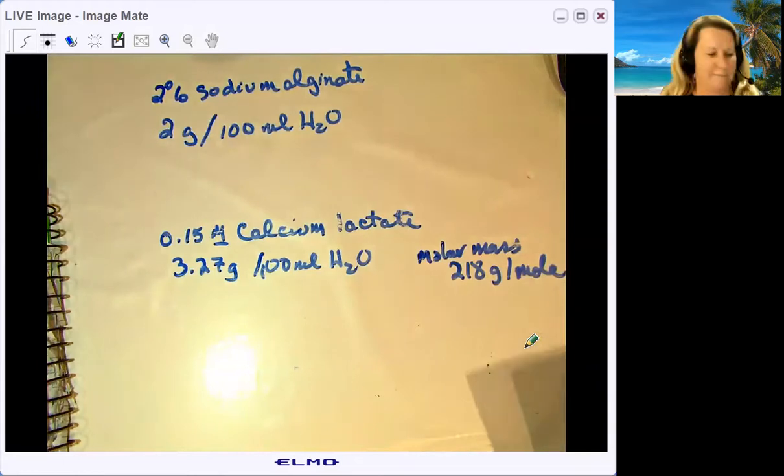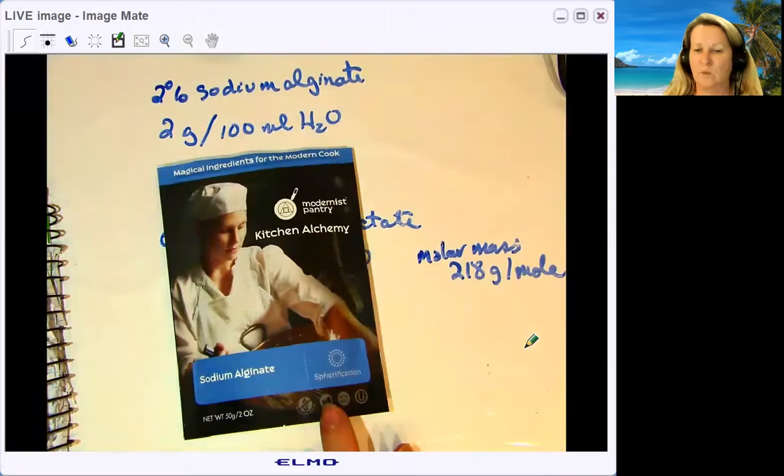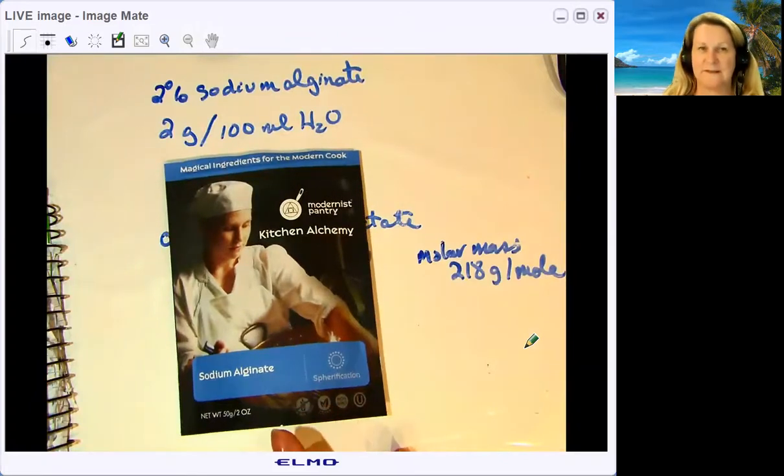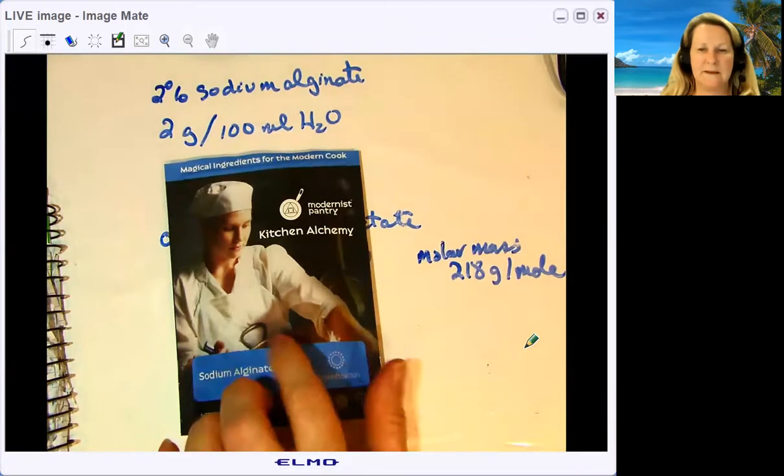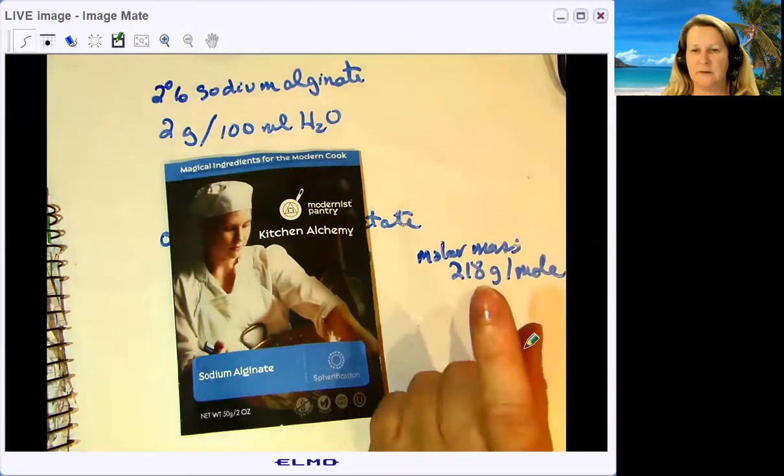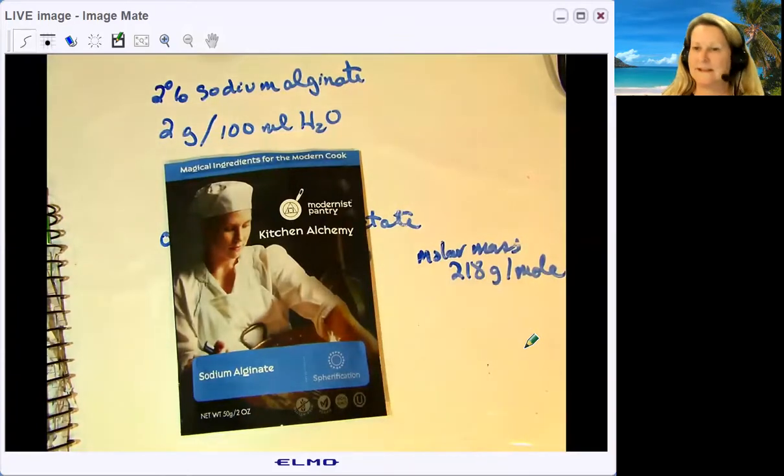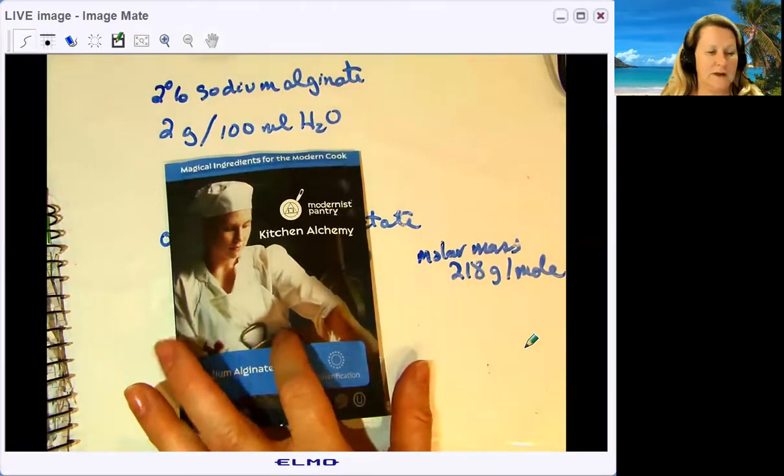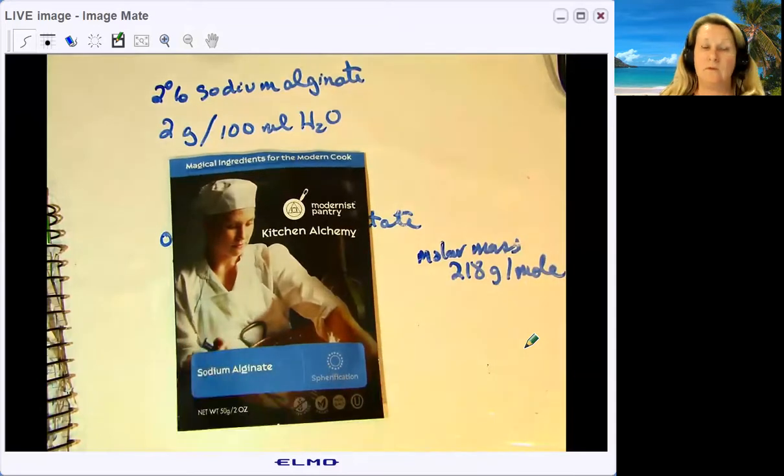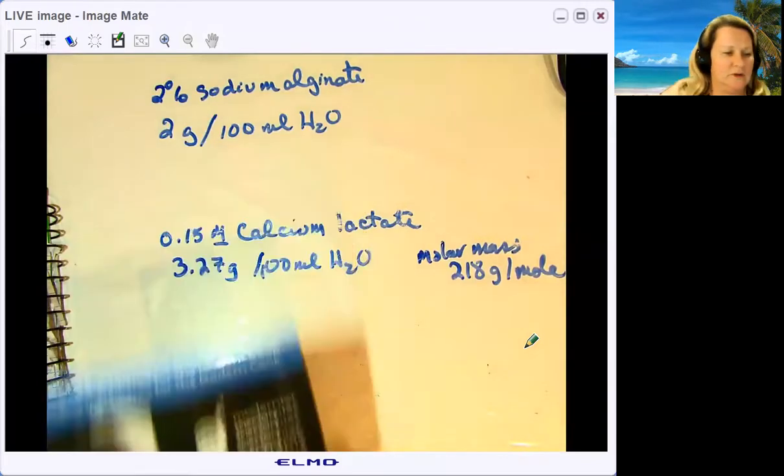Let's talk about the sodium alginate first. When you put sodium alginate in water, it's a really viscous solution. You don't want to make up a whole liter and try to pour it out for every lab group—that won't work well. When I make this up, I get a bunch of 150 or 200 mL beakers and make up 100 mL for each lab station. 100 mL is more than enough for three or four lab groups. You want to add 2 grams to 100 mL of water.